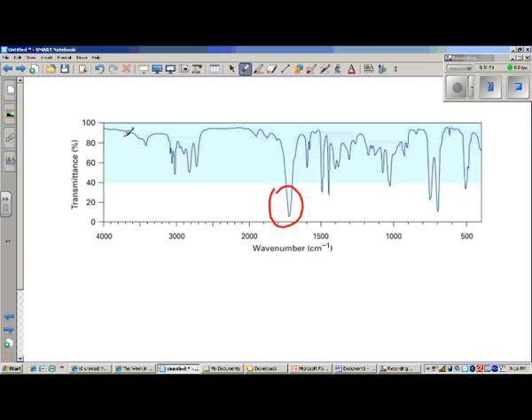because that's probably going to be something. And then anything that's 3000 or above, you want to make a note of too, because that's probably important as well. And also notice, you remember we said virtually every molecule contains the big set of CH stretches just below 3000. Well, notice we don't have that here. We have some stretches above 3000, so that tells us something special about this molecule. It tells us there's probably no CH, or at least no aliphatic CH. Aliphatic means not aromatic.